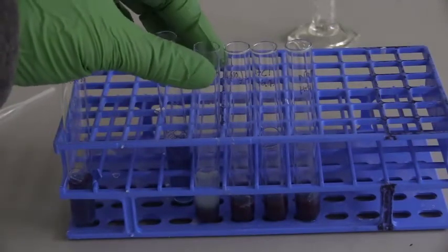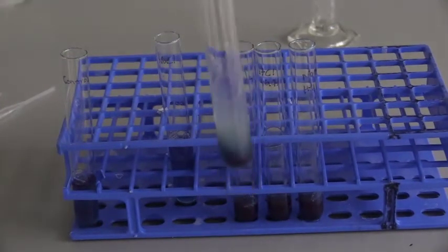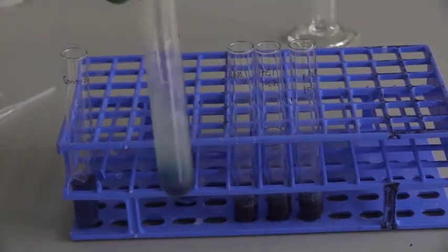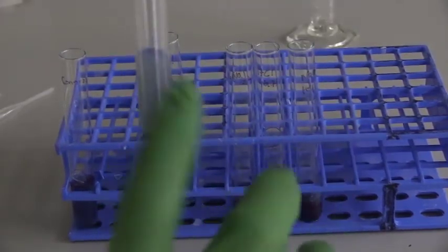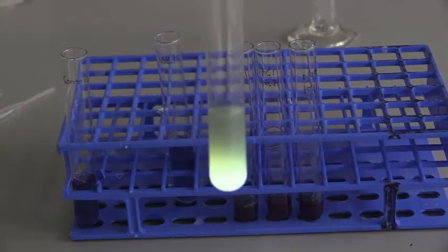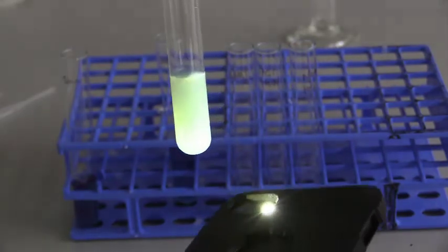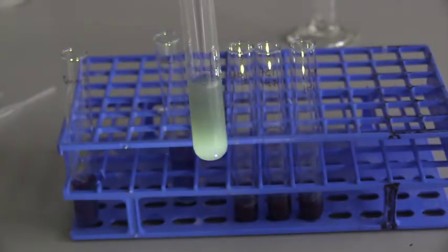Next, I will add ethanol to the sample. You can make your observations once the tube is stirred up. We can shine the light on that to see if the protein is still folded. So you can make your observations there. This is with 95% ethanol.